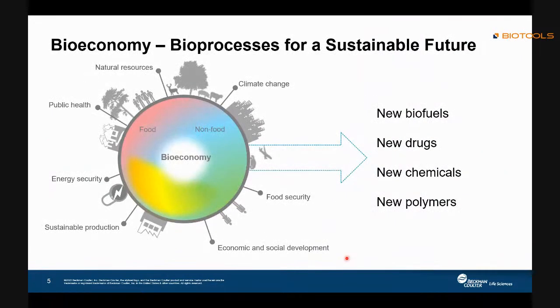From the introduction, the first question is why and how we need this kind of instrument. We all know that in the past we used a lot of the earth's resources, but for the future, bio will be something that everyone wants to have, like biofuel.